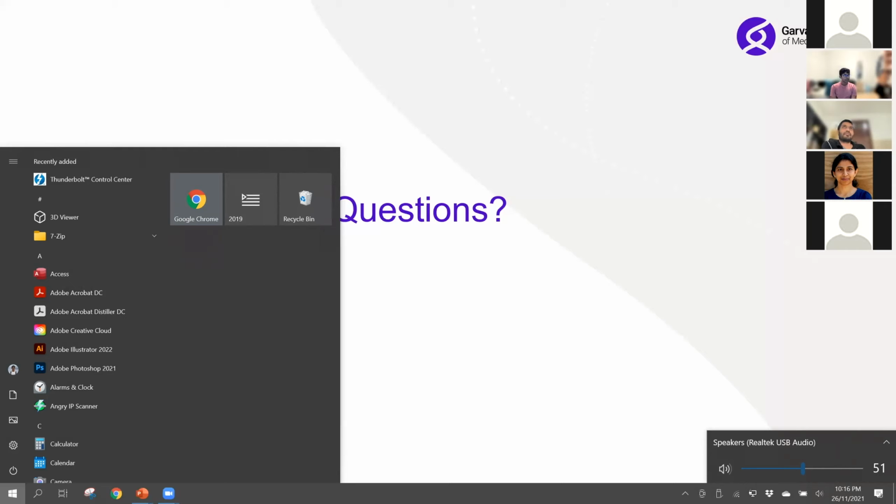So in a case like that, having a base caller which converts the current sensor input into these ACGTs would be pretty beneficial.